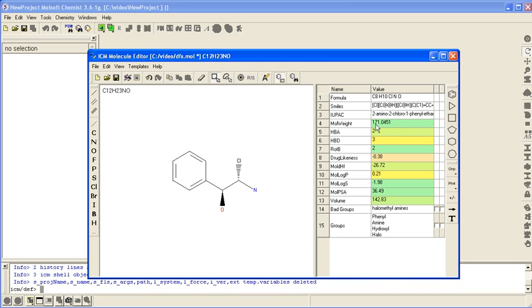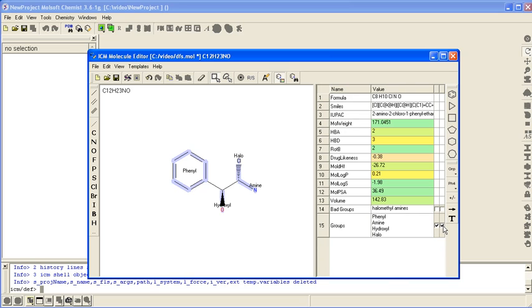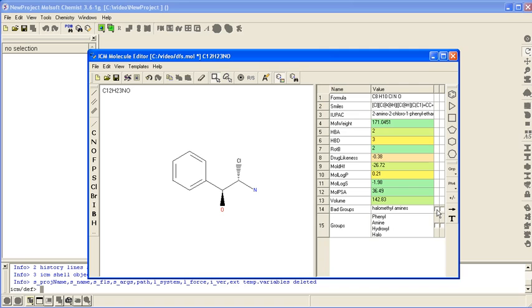For the property in terms of not only the Lipinski's rules but other models that we have developed, you can flag certain groups. Clicking here and label them, and it will also flag out potentially toxic groups such as this halomethyl amine here.